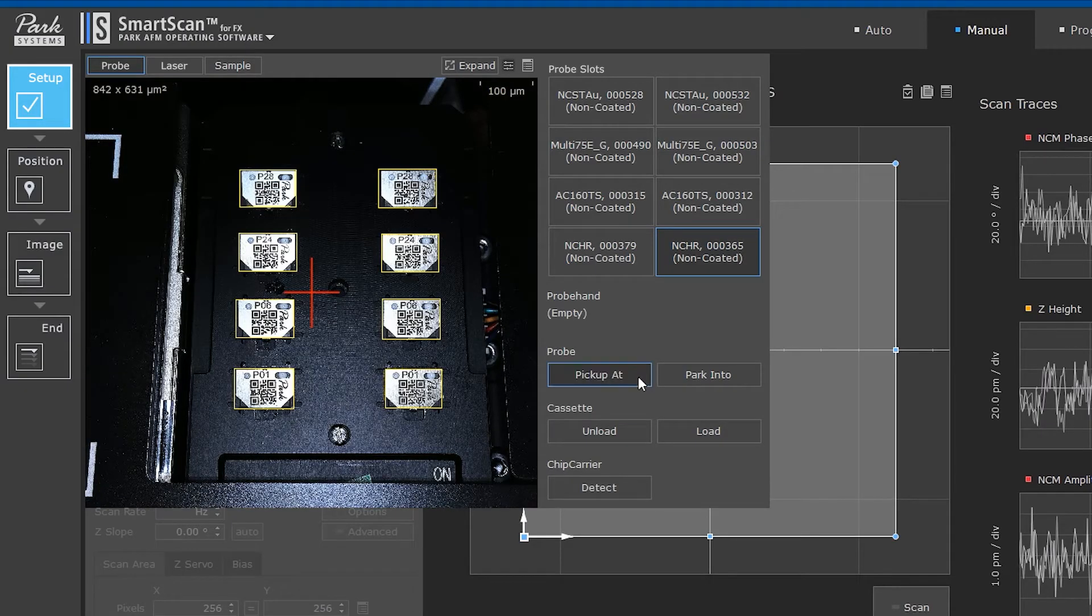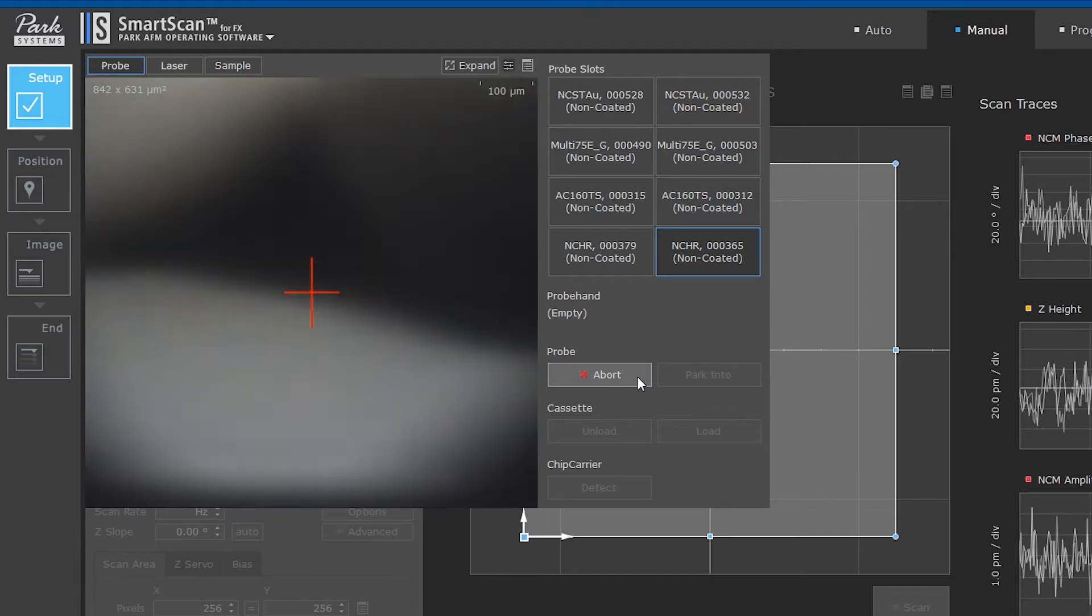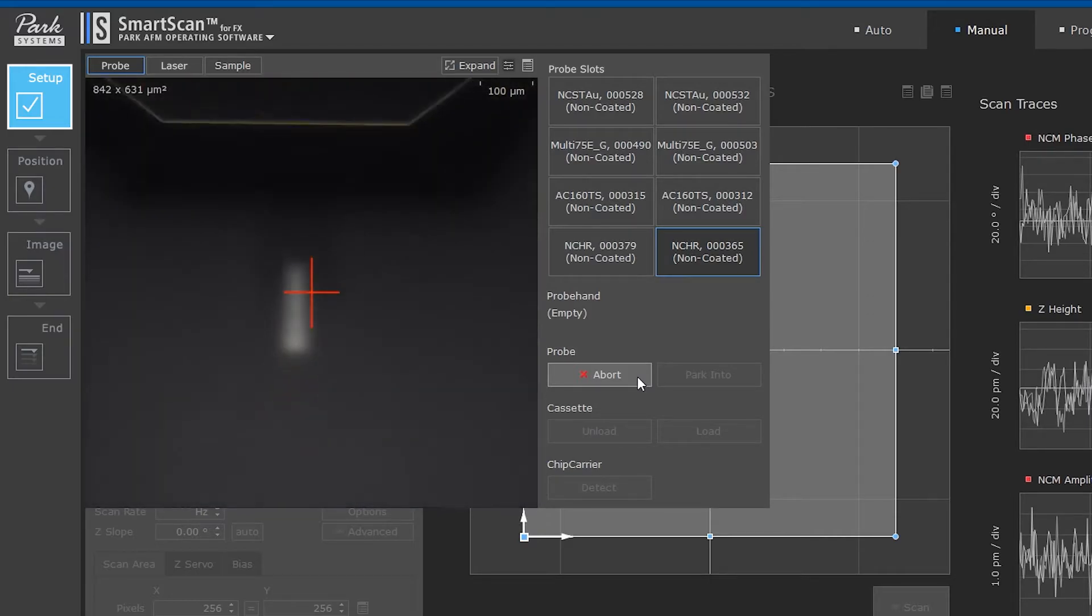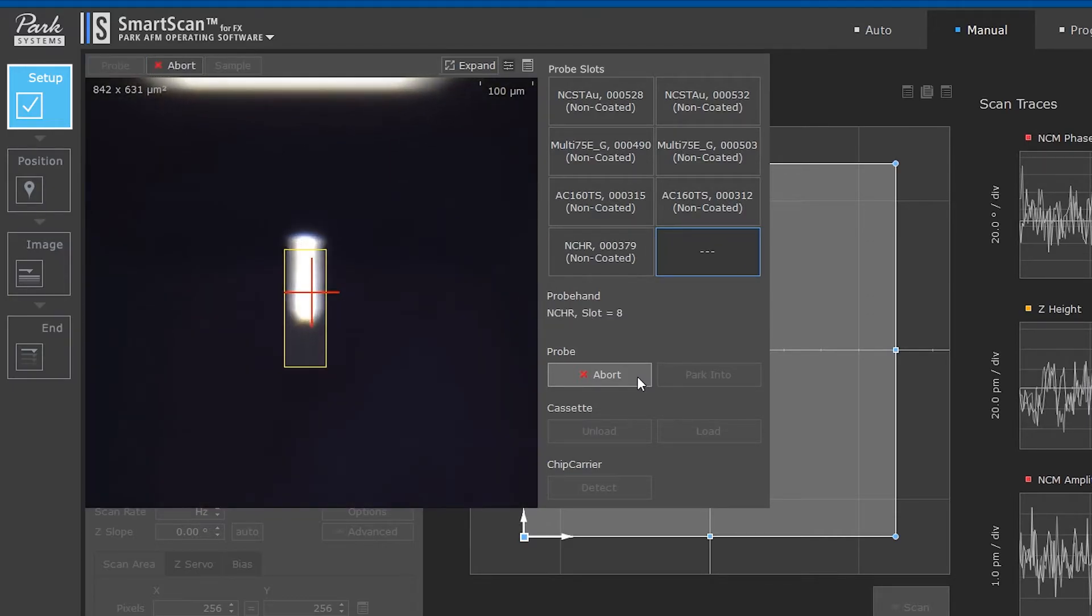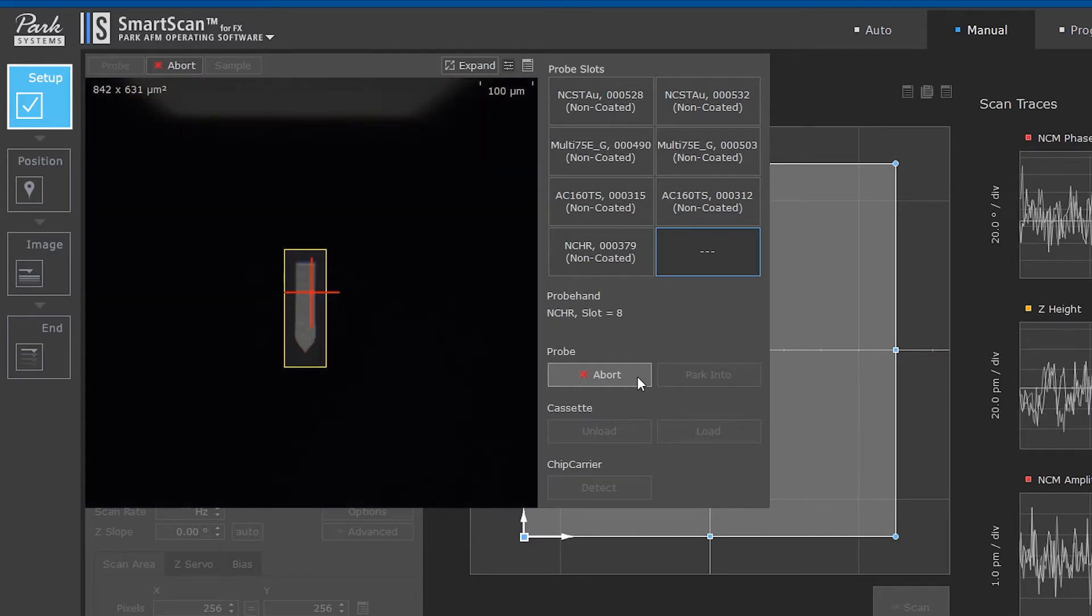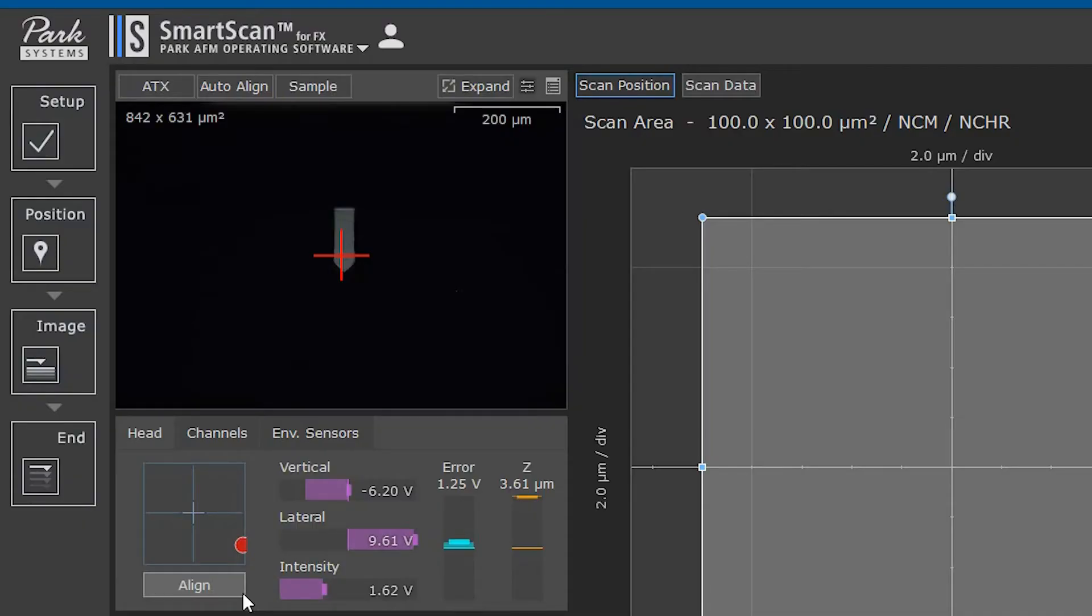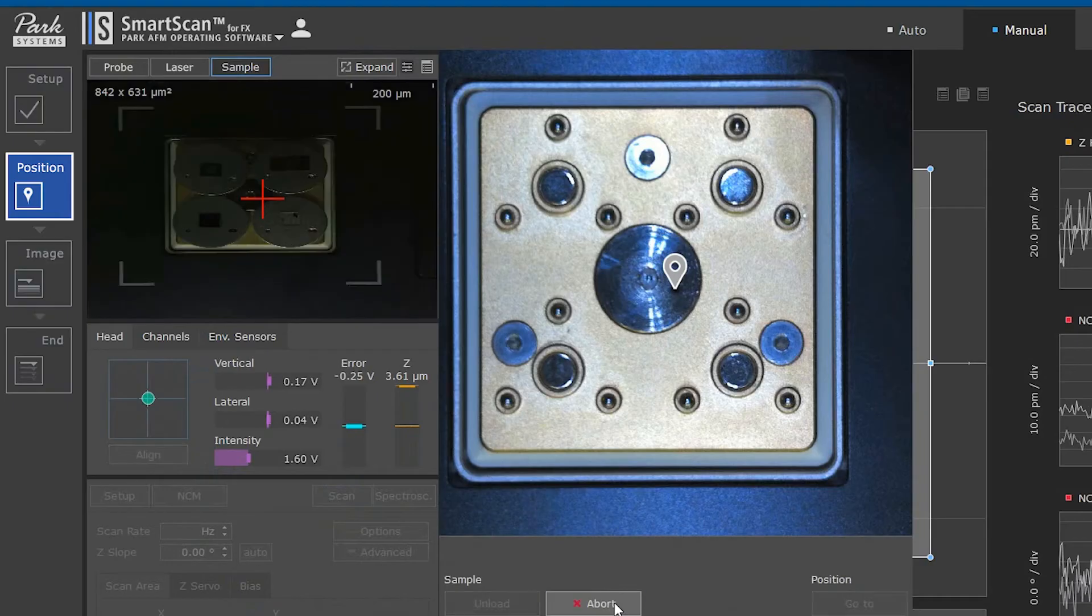After the user selects the tip, the chip carrier is loaded onto the AFM head and the initial position of the cantilever is detected. SmartScan will align the SLD beam onto the proper position of the cantilever and prepare to move to the sample.